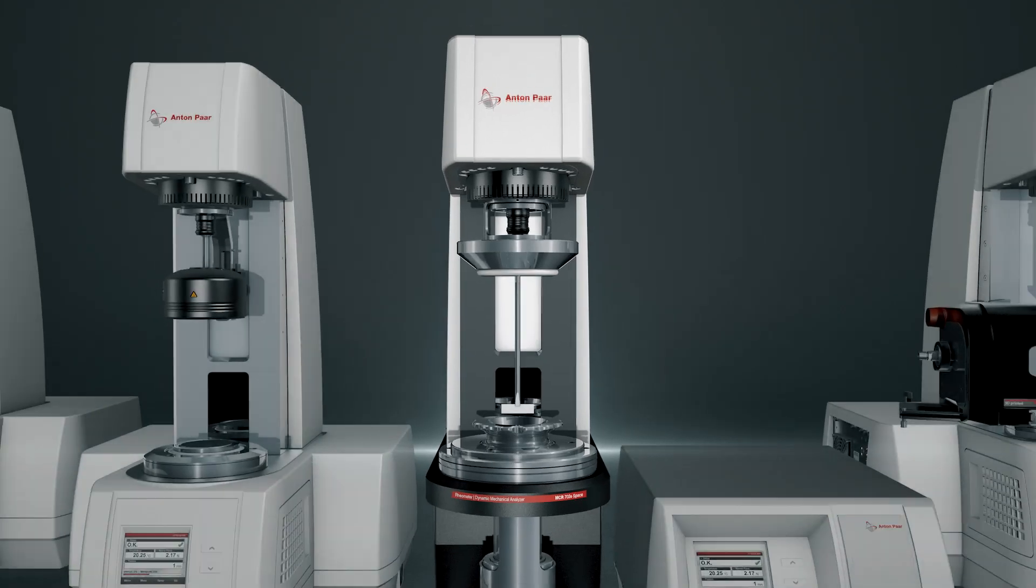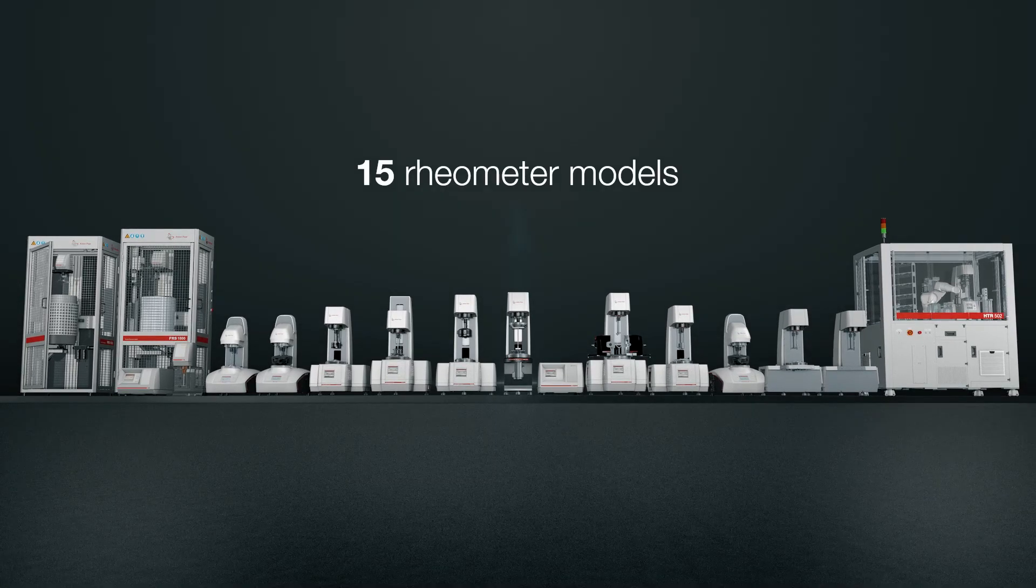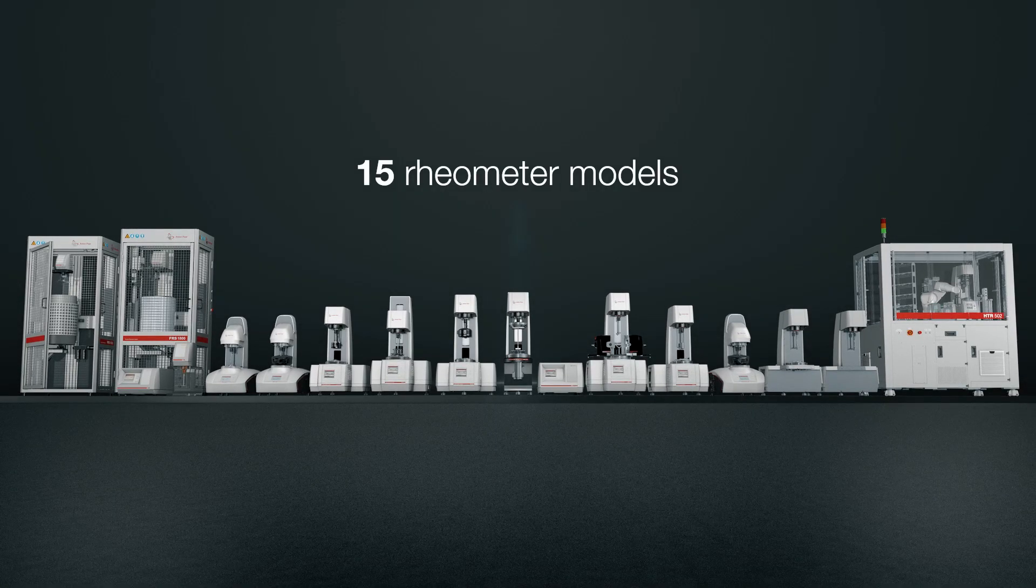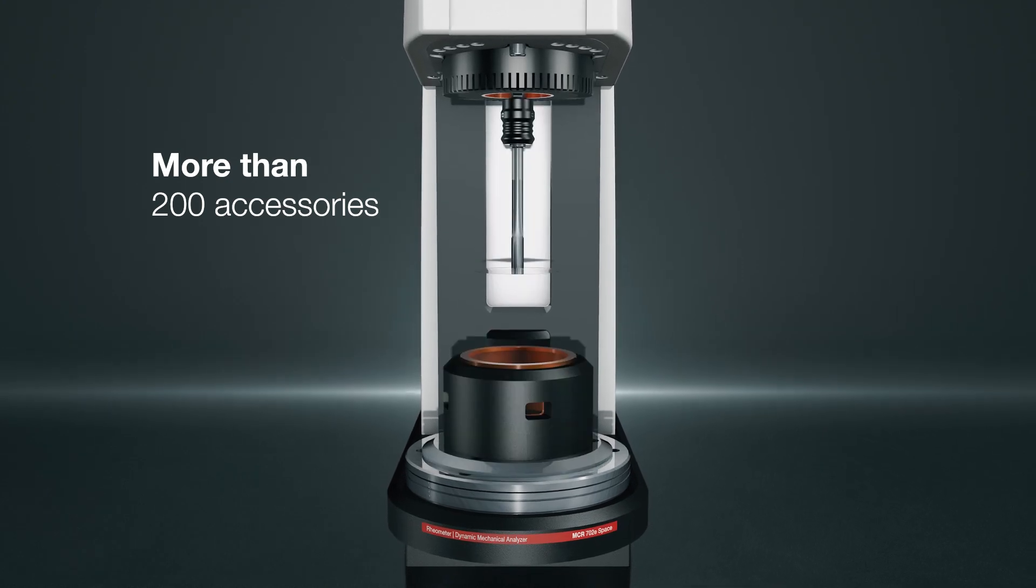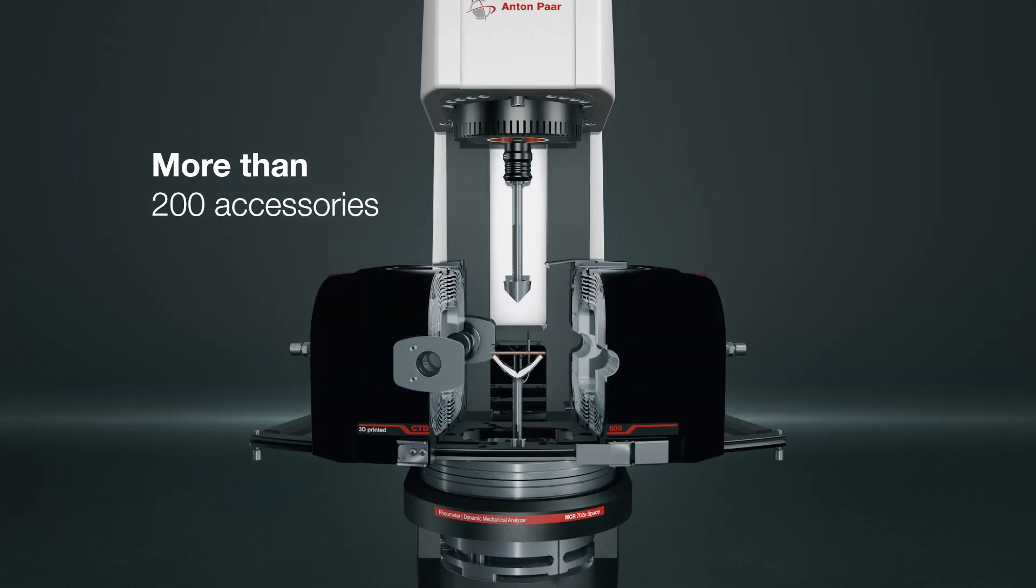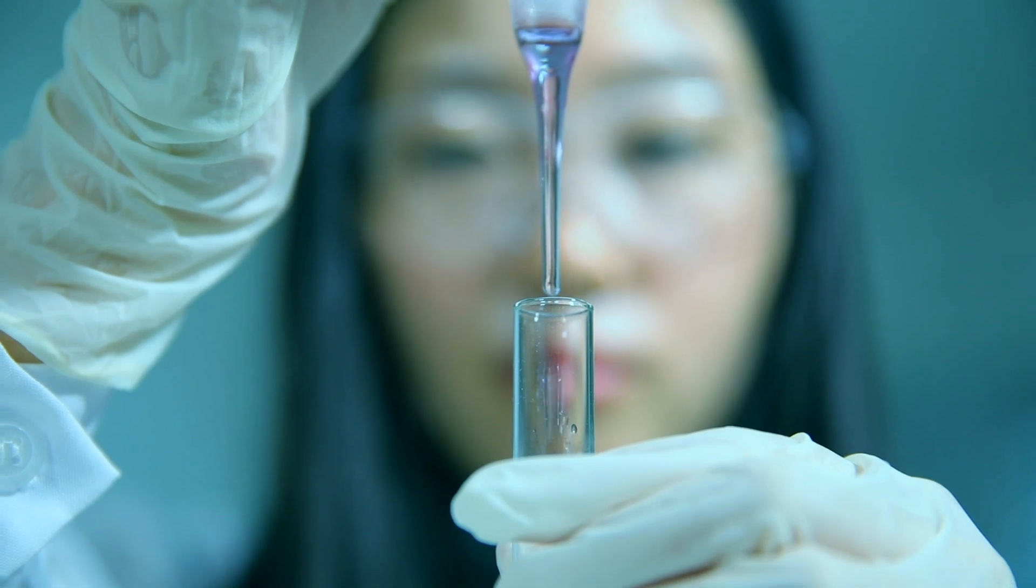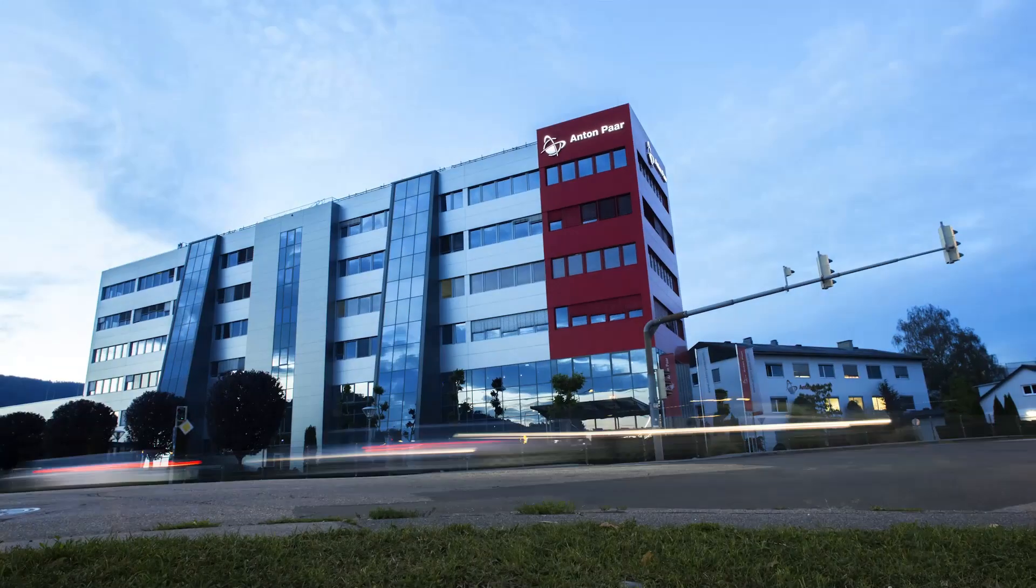The result? A rheometer lineup incomparable to any other brand on the market. 15 rheometers. More than 200 accessories. The gold standard for custom rheological solutions. For every application. The gold standard set by Anton Parr.